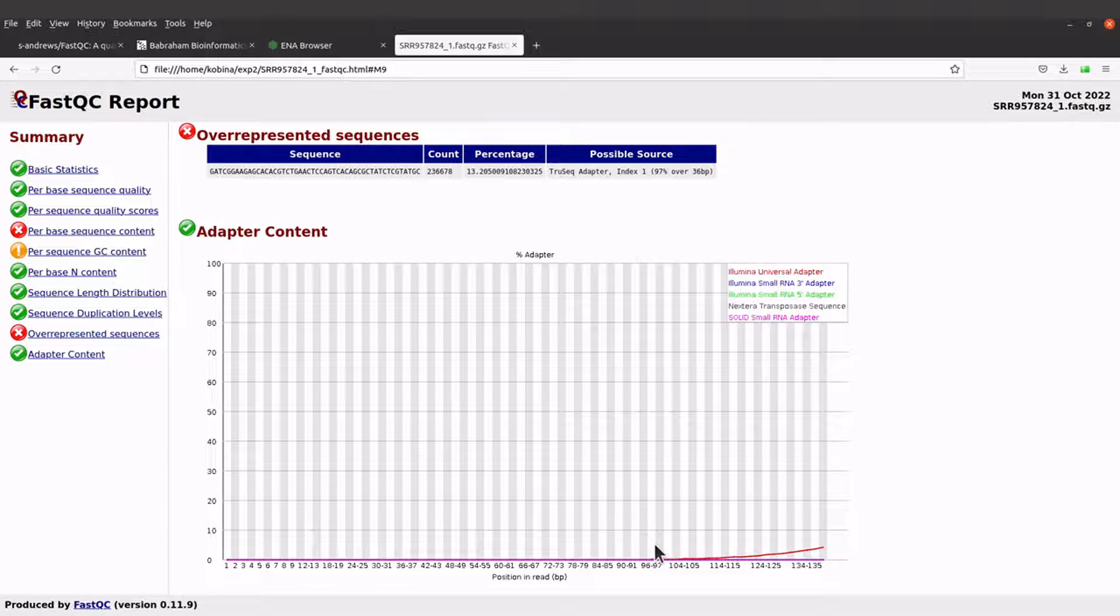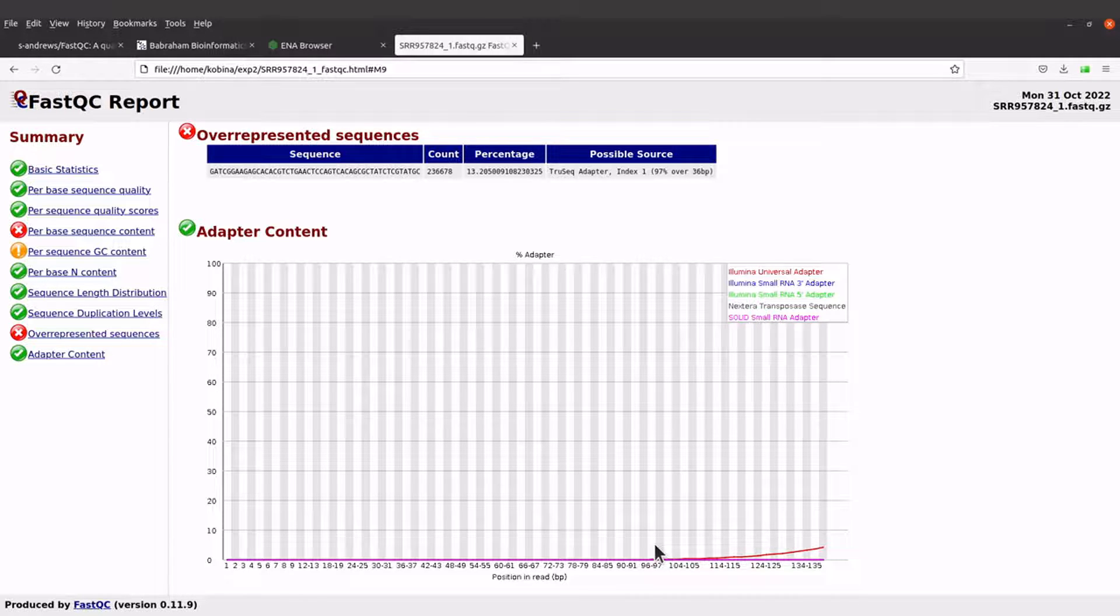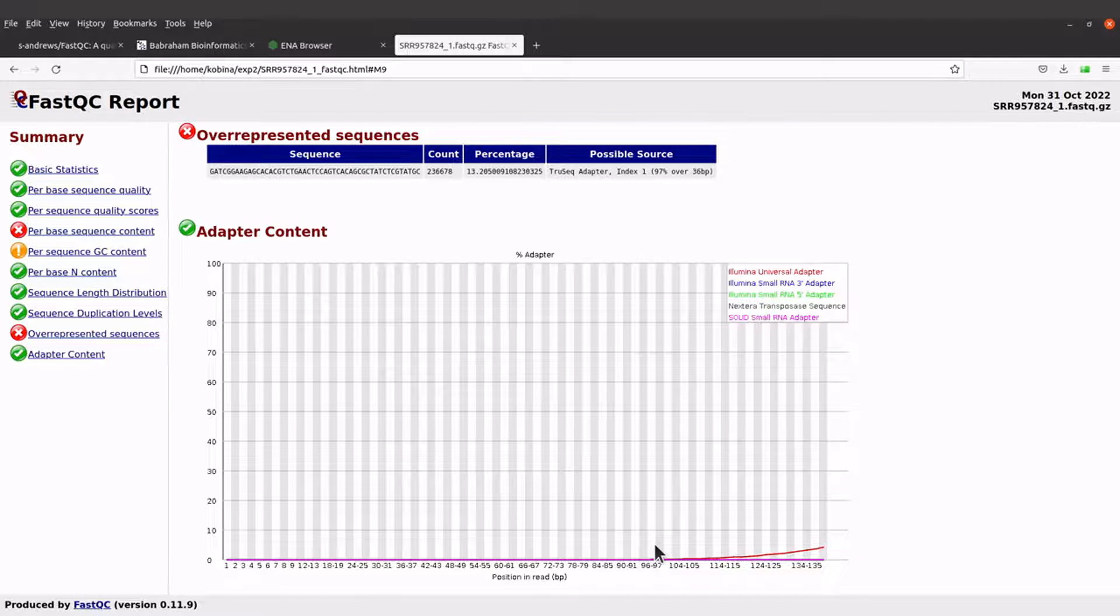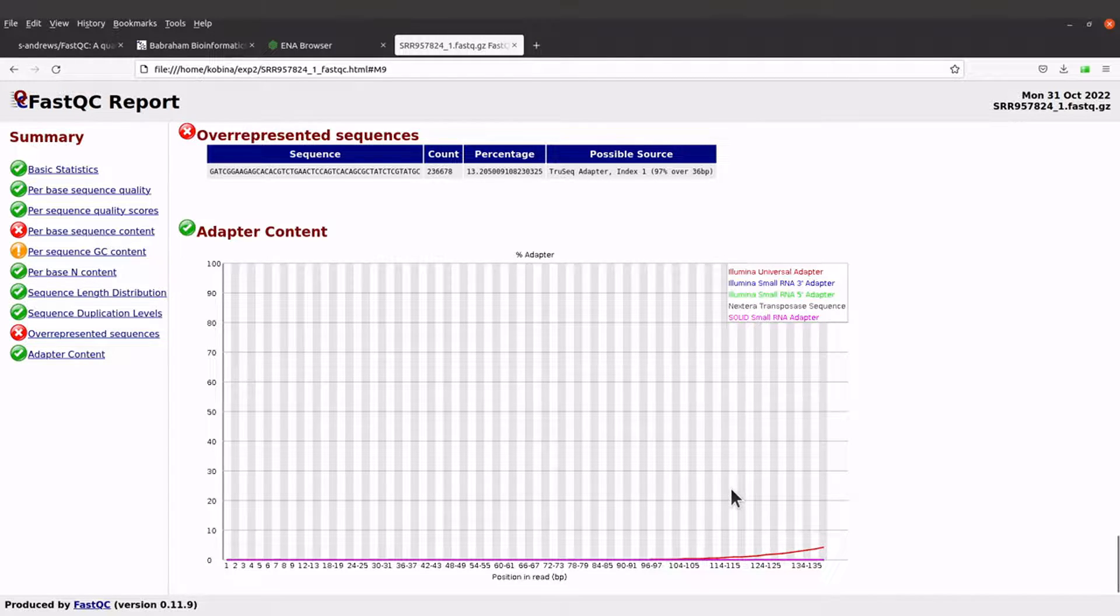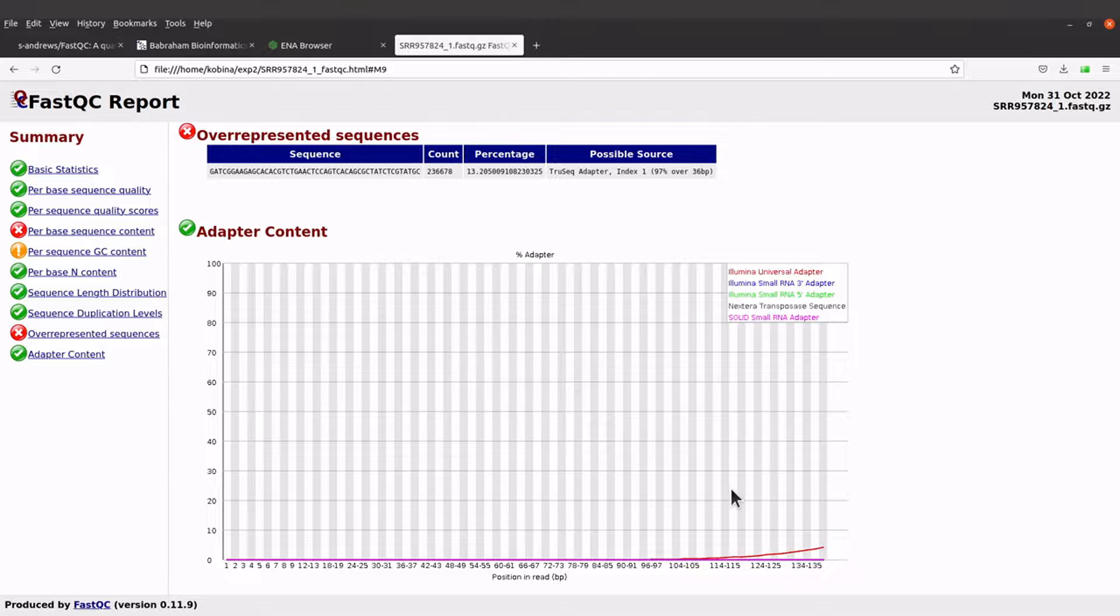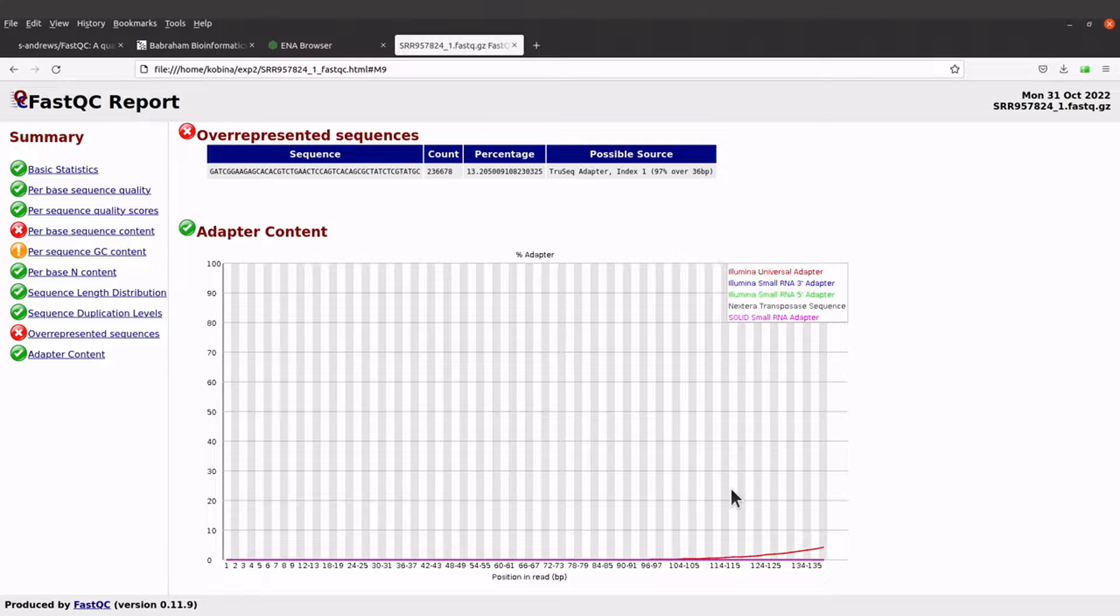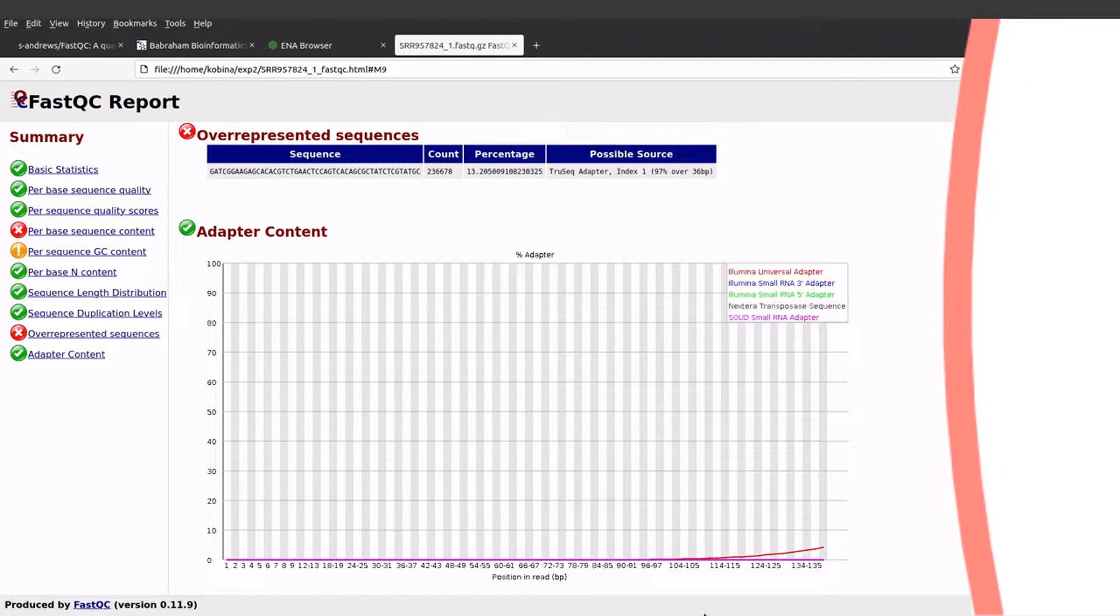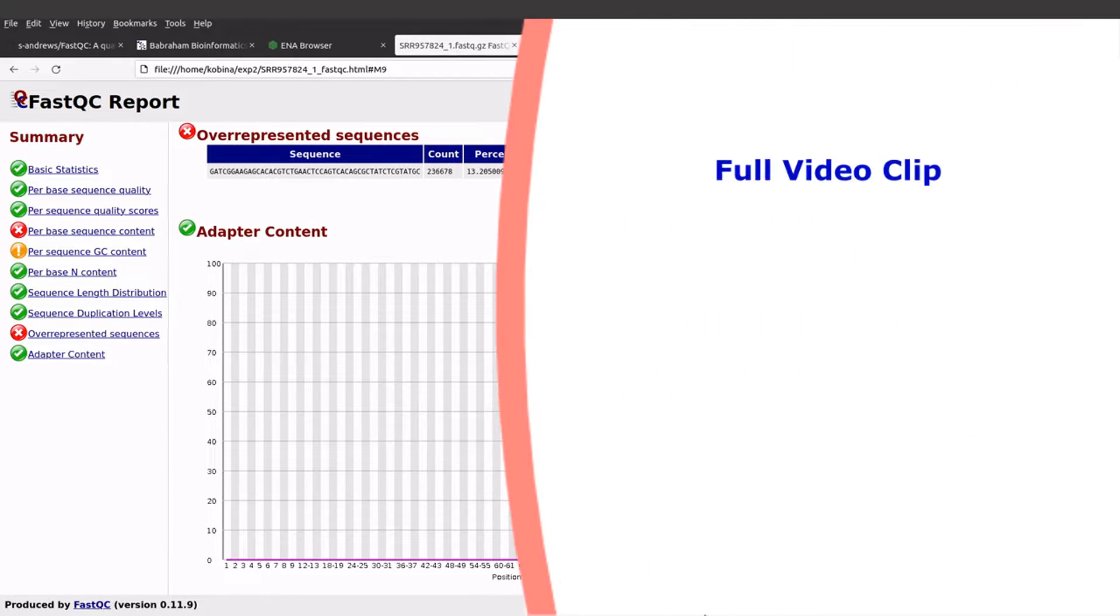You can also trim the adapters. If you want to trim the reads in addition to the low quality reads, you can also use the trimming tools to remove adapters. There are other options you can specify depending on the tool that you are using for the trimming. These are things that you have to read about.